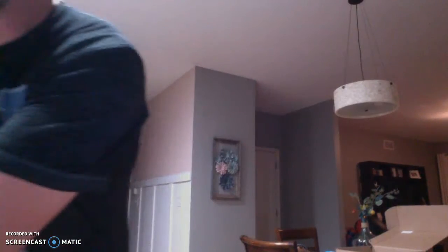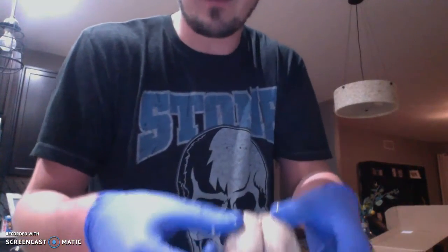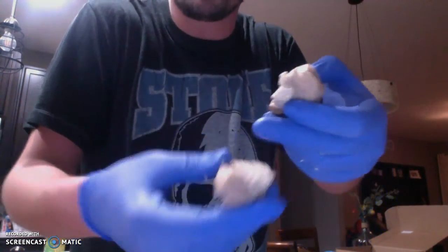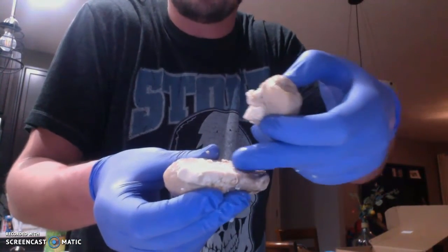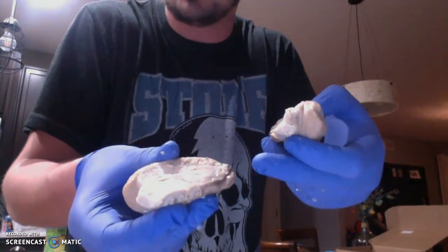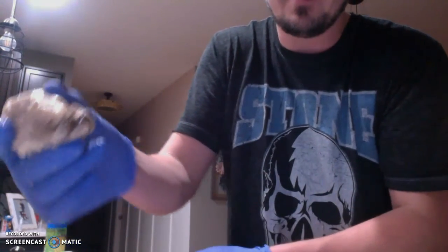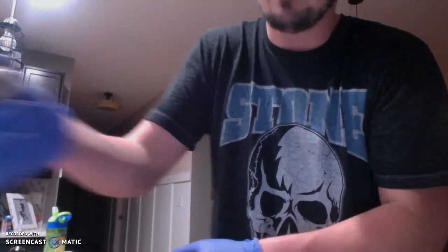The cerebral cortex is simply the outside of the brain here. The outside is the cerebral cortex. White matter is, obviously, the cerebral cortex consists of gray matter. White matter are the bands underneath that contain myelin, and they connect different tracts and different communication sections within the brain. So it looks like my sheep was butting heads a lot. Looks like there's some brain damage there in the front. You could see some there.